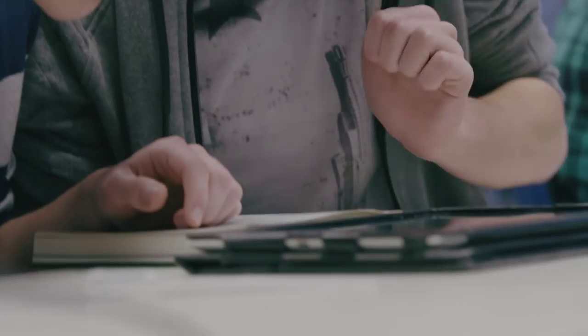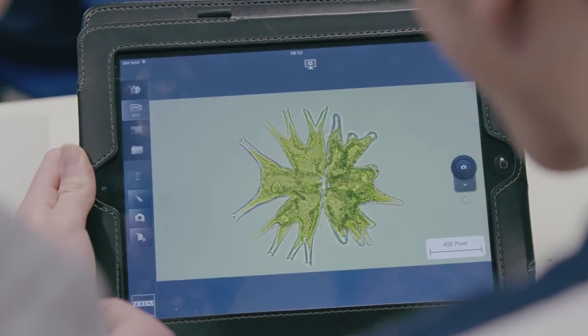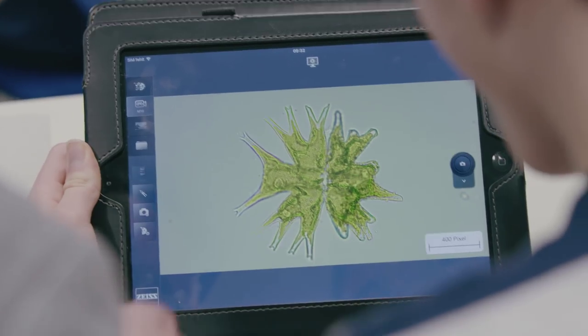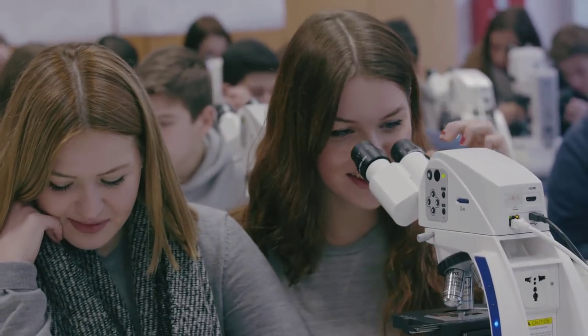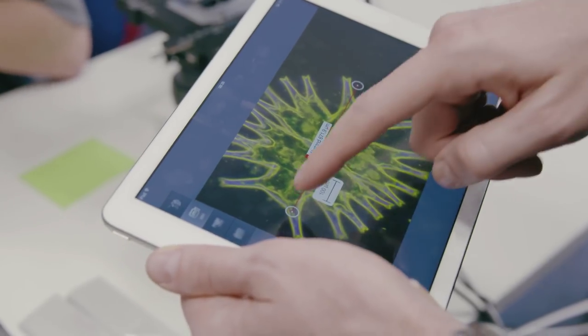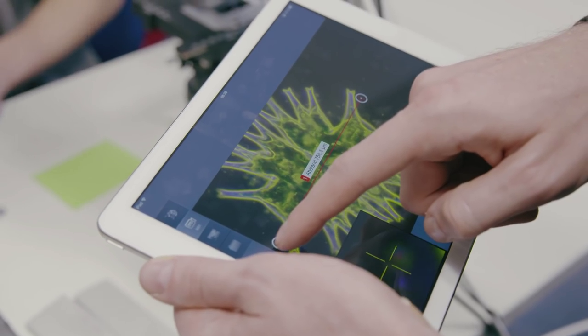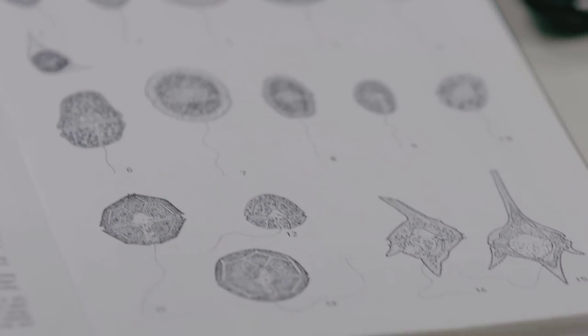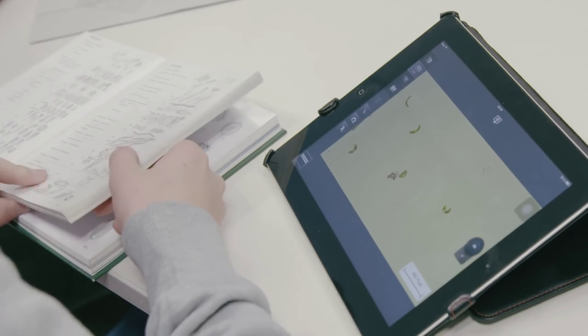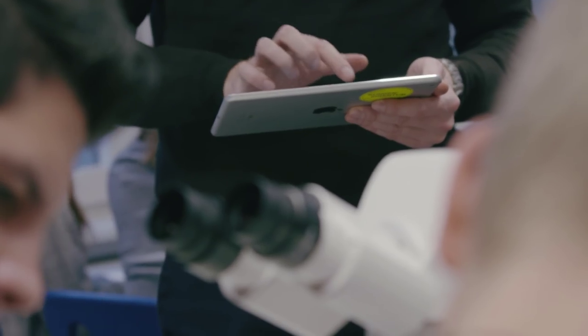For the students, using the microscopes in connection with the tablets is particularly motivating. Being able to measure objects directly on the tablet is a nice feature, and that makes it significantly easier to identify them.